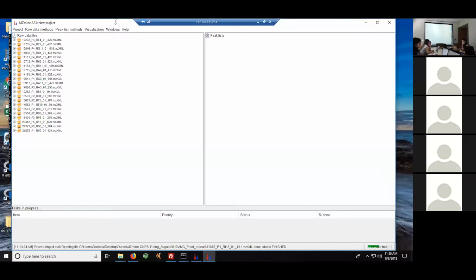Okay, it's that one. Yeah, try it. And if not, you can just download the processed files through the web interface, and then you can follow up, maybe work together with Julia. That's okay. I just tried to download it, but it didn't work.